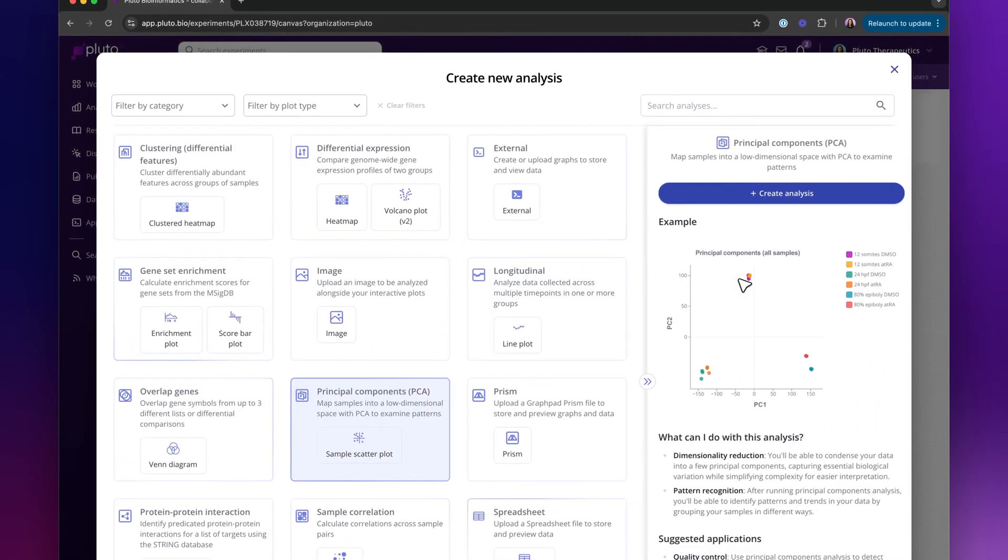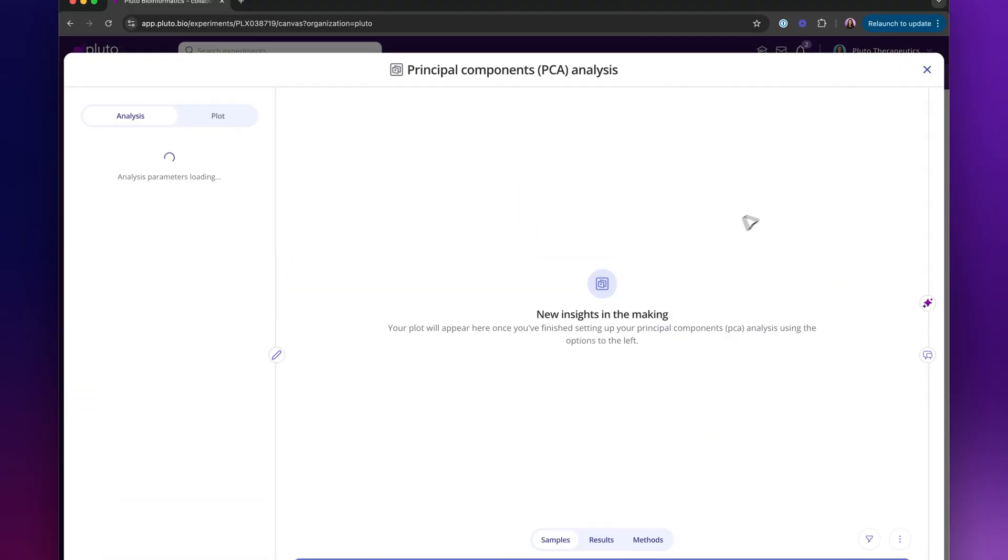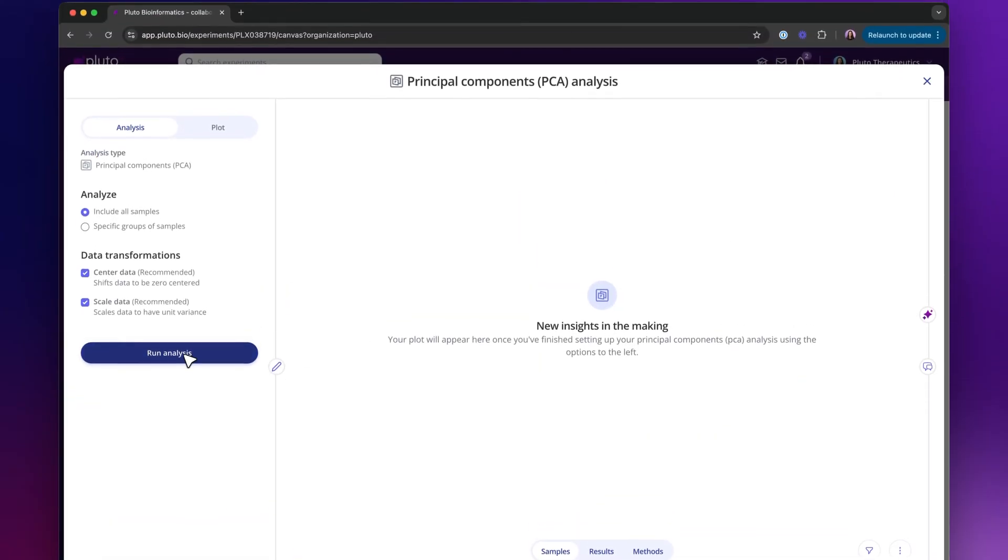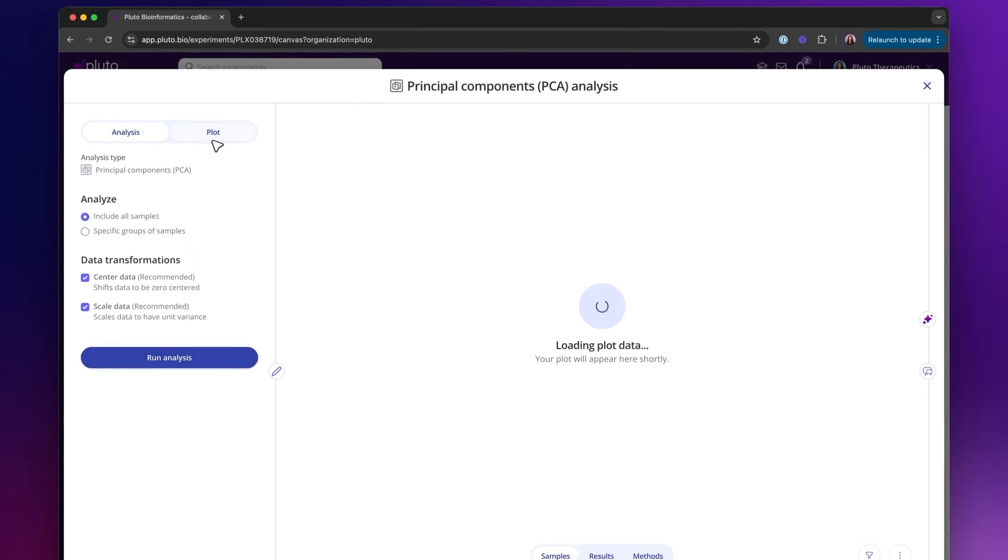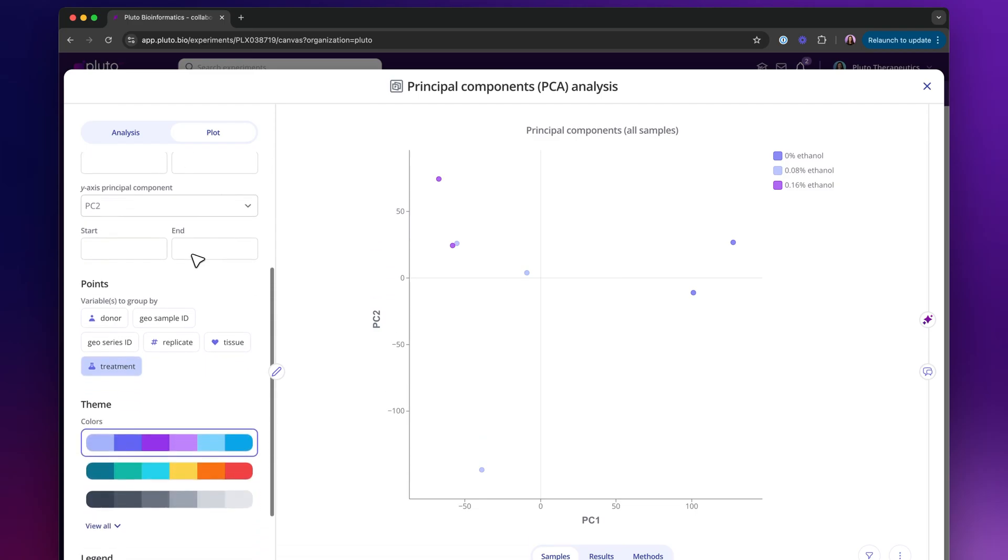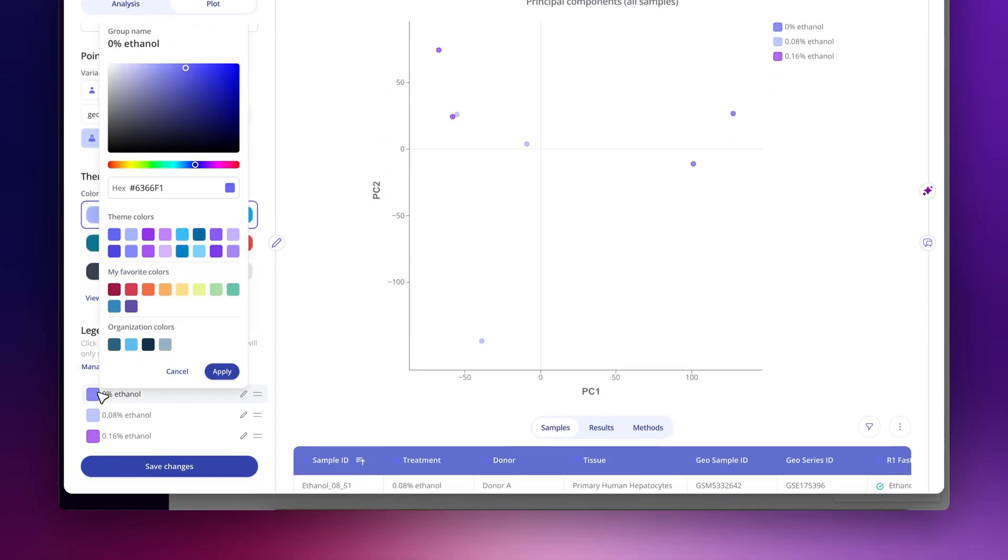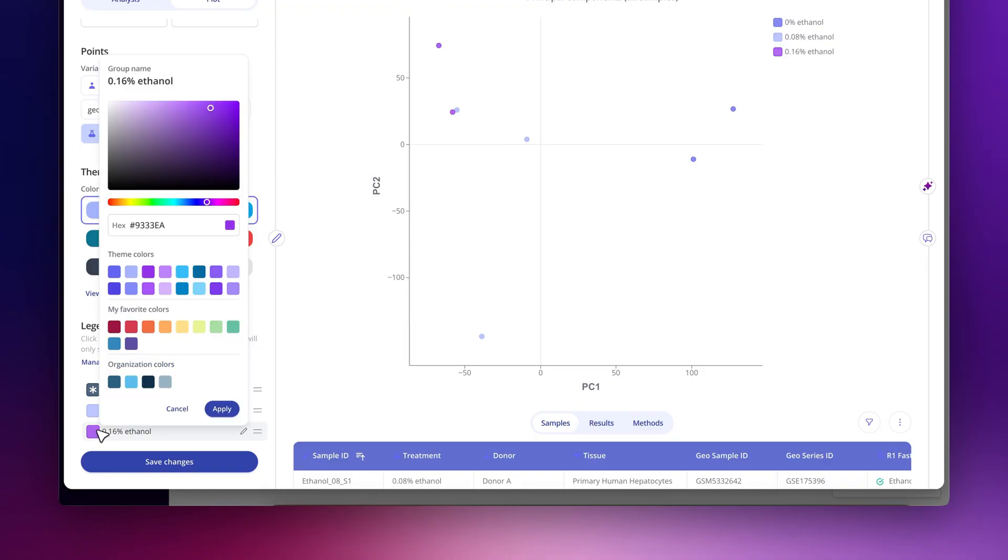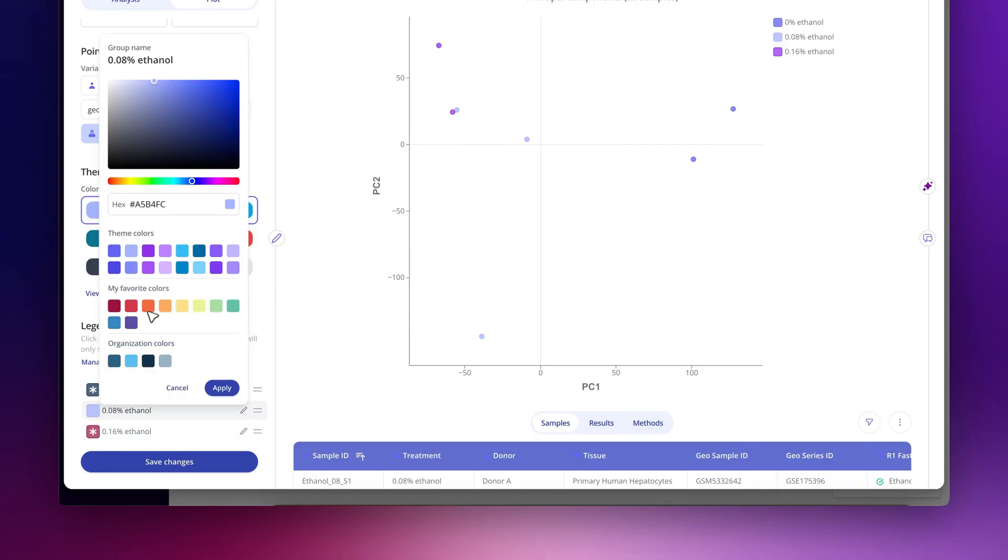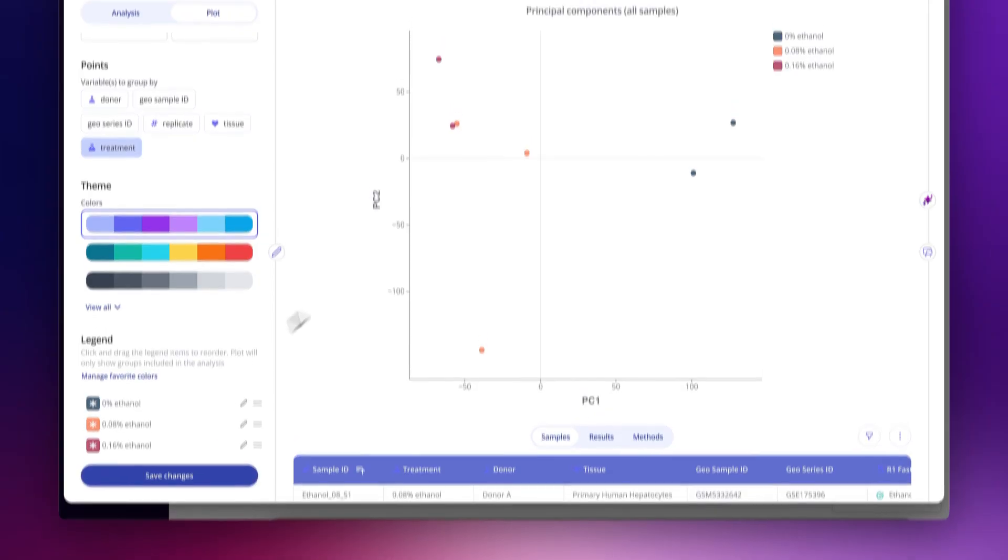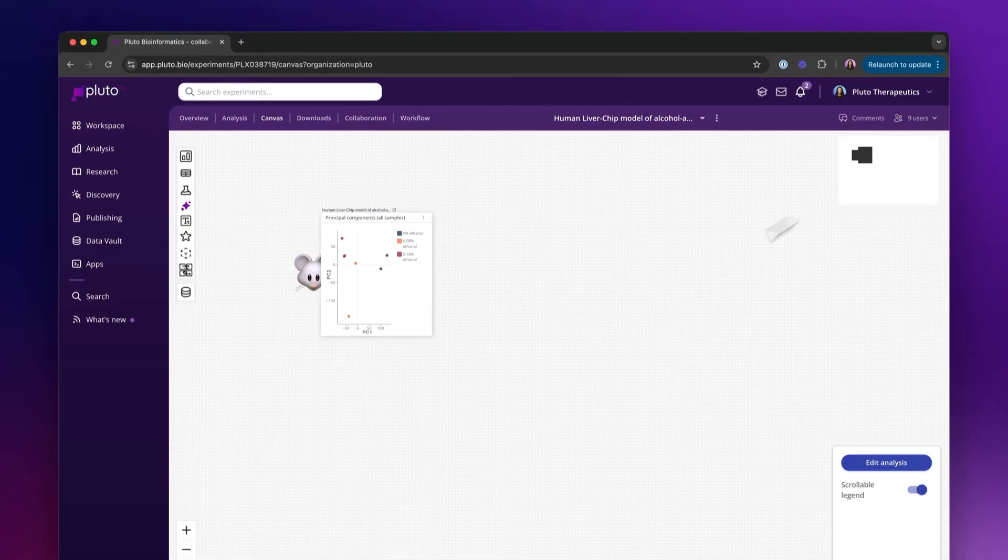I might want to start with a principal components analysis. I can create and set up that analysis with the parameters on the left, customize my plot in terms of appearance, colors, or ordering the legend, and see those changes reflected in the graph.